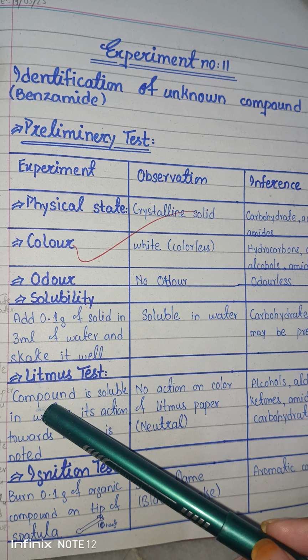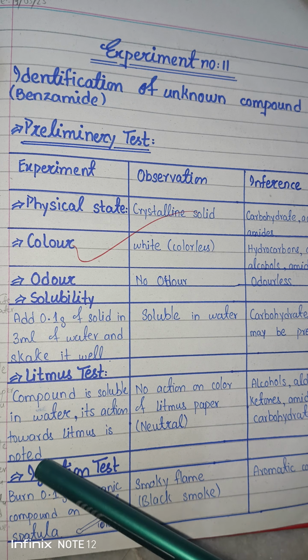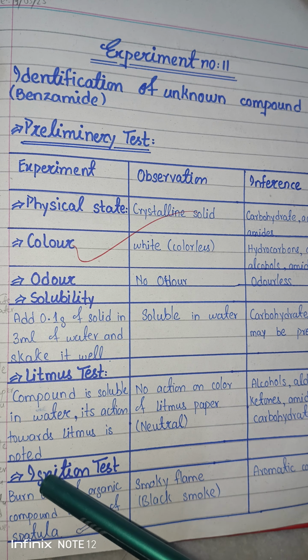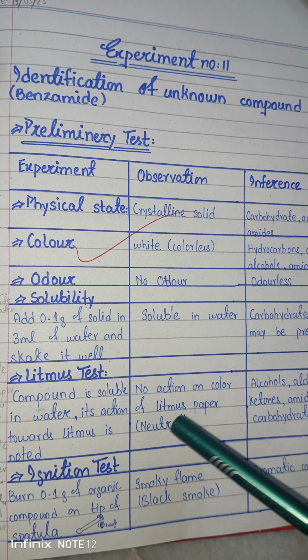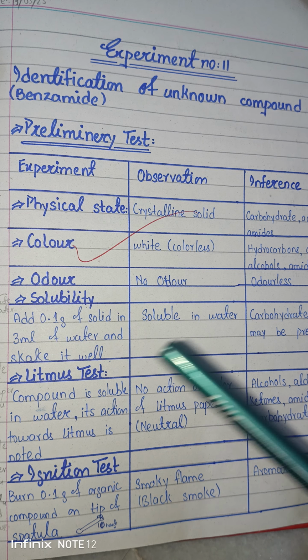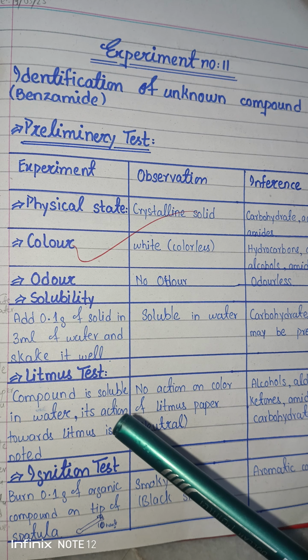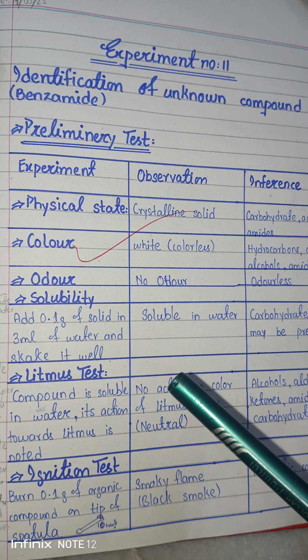So the compound is soluble in water; take one drop of it, put it on the litmus paper and note the result. No action on the color of the litmus paper. It means no color change, so therefore it is a neutral compound. Some compounds are neutral, and neutral compounds have pH 7.